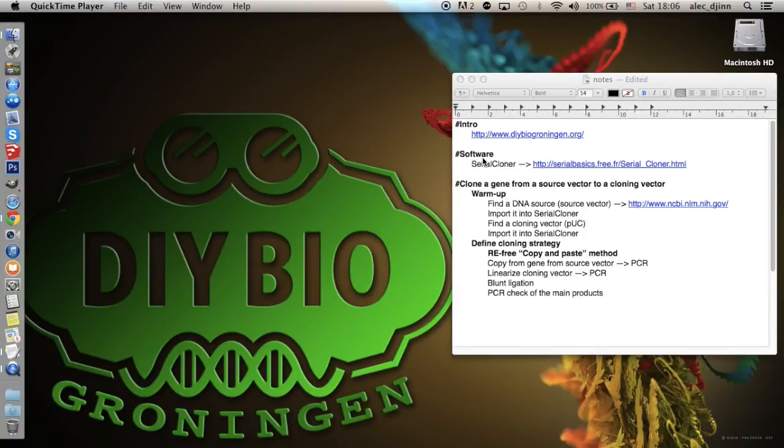The software used in this tutorial is called Serial Cloner. There are many software packages that can be used instead, but I've chosen Serial Cloner firstly because it's cross-platform and open source, and secondly because it's both easy to use and very complete.